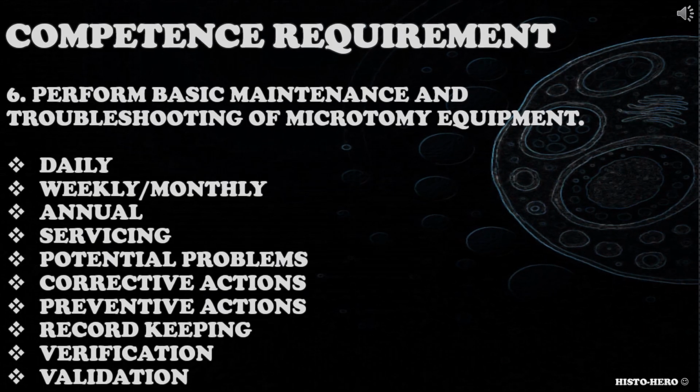The sixth competence requirement is perform basic maintenance and troubleshooting of microtomy equipment. Candidate should be able to do basic microtomy equipment maintenance and troubleshooting. Can the candidate perform maintenance of microtomy equipment? Can they troubleshoot problems with microtomy equipment? Do they know the common problems associated with microtomy equipment? Do they keep record trail and documentation when performing maintenance and troubleshooting? Do they perform maintenance on regular basis? Do they follow local methodology for maintenance?